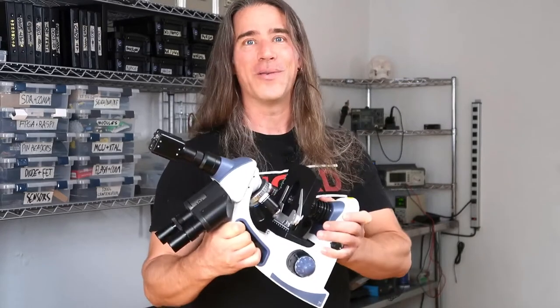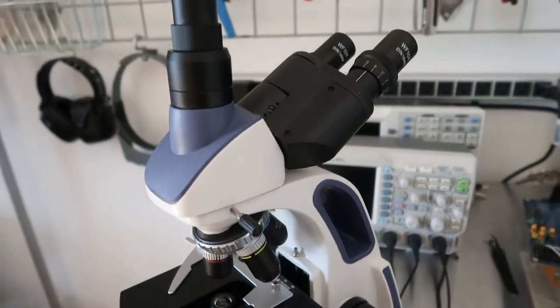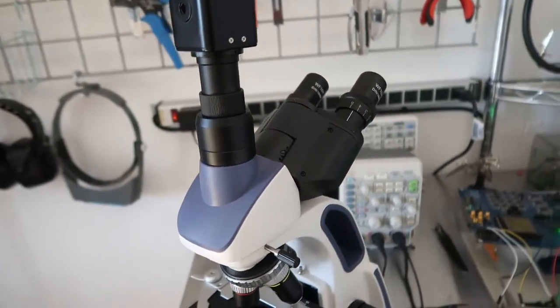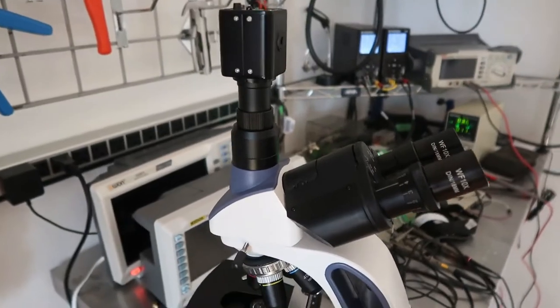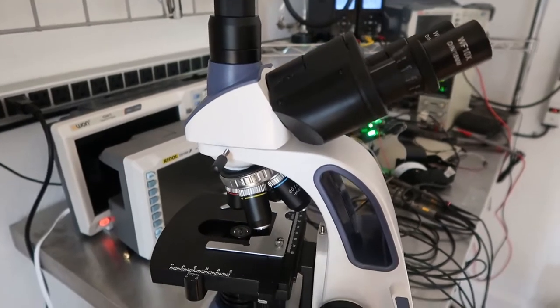Yesterday I got this baby and gave her a spin. I'm a total noob and know nothing about this — haven't used a compound scope since school — but I'm still pretty happy about what I managed to see. The microscope is a Swift SW380T with the usual 4, 10, 40, and 100X oil immersion objectives. I wish they'd drop the 100X oil and just give us 60X, but that's the standard.